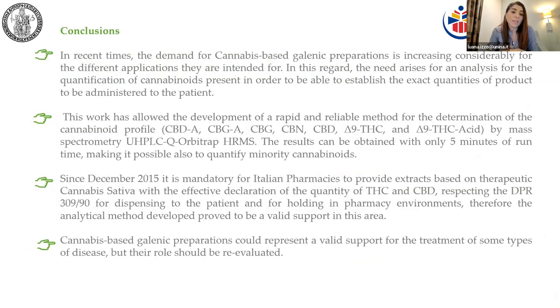So, in conclusion, I've reported a simple, useful method that in only 5 minutes is able to obtain the chemical profile, the cannabinoids profile, and for this reason is a very good method that can be applied as a valid support for this galenic preparation dispensing.